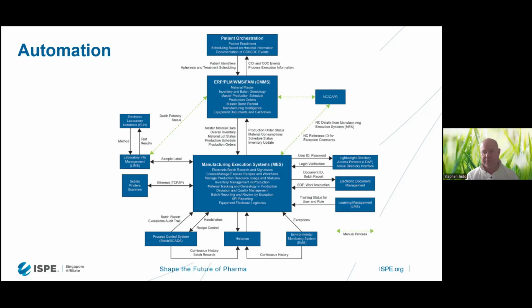And one of the aspects that I was mentioning before was that cost of goods for autologous therapies in particular will potentially push us to the decentralized manufacturing model.